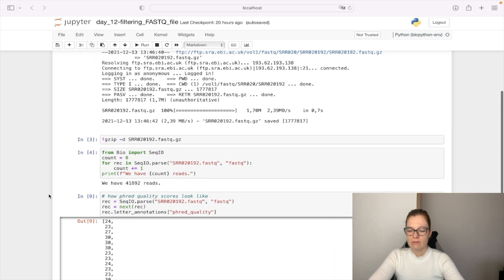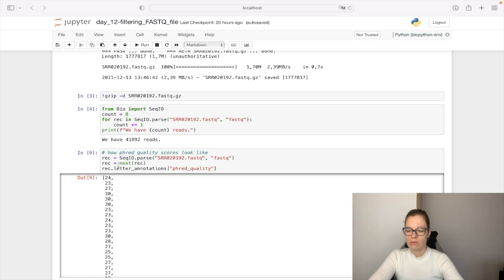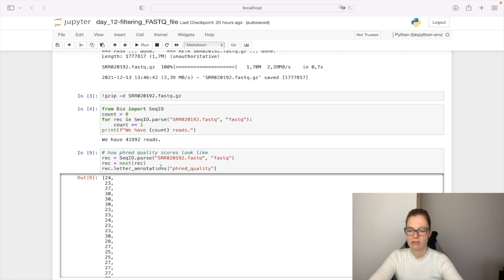Then we check on our sample sequence how the Phred quality scores look. We can access them by using the letter_annotations attribute, which gives us back a dictionary.